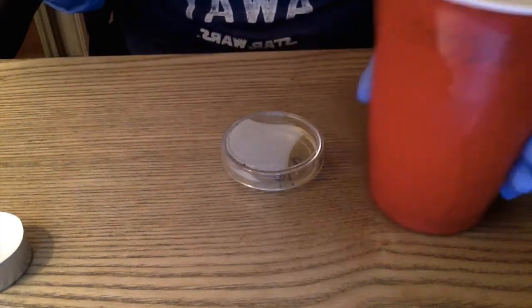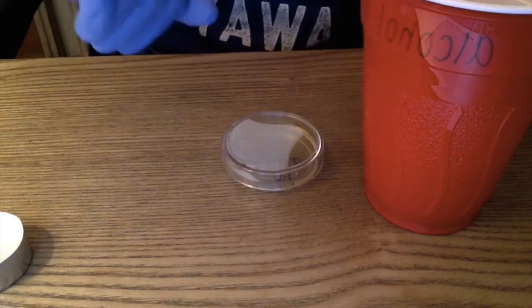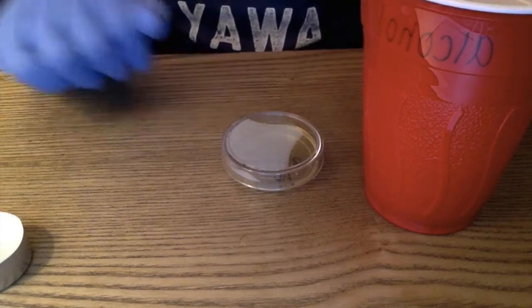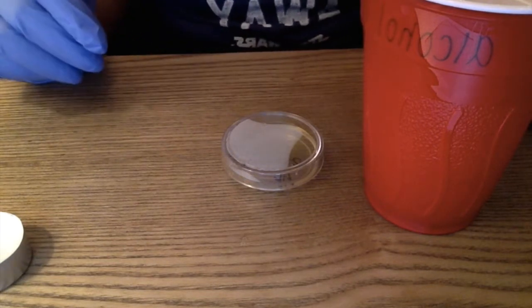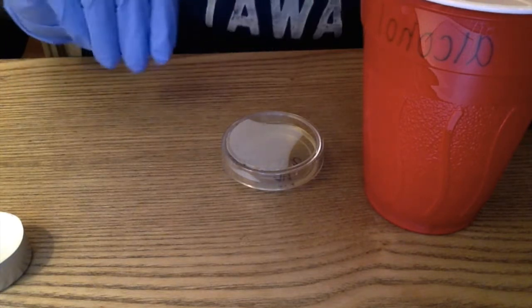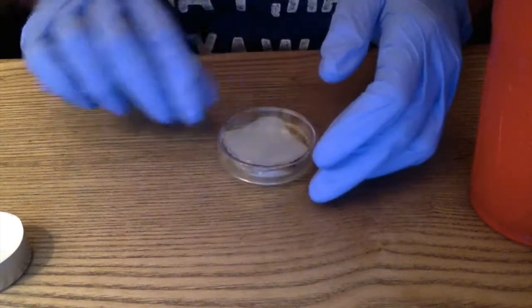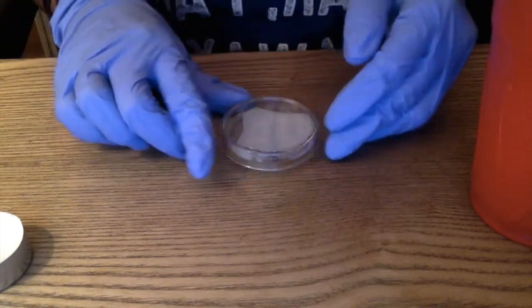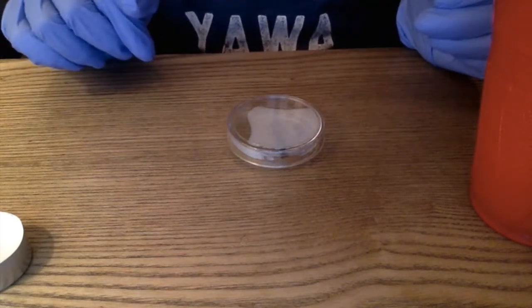This time I'm going to leave the inoculation loop inside of the alcohol for about 20 seconds before going ahead, and I'm pretty much just going to go ahead and repeat the same process there for quadrants 3 and 4. Now we can go ahead, and I'm kind of just turning the agar plate just so I know which quadrant I just worked on and which one I need to.